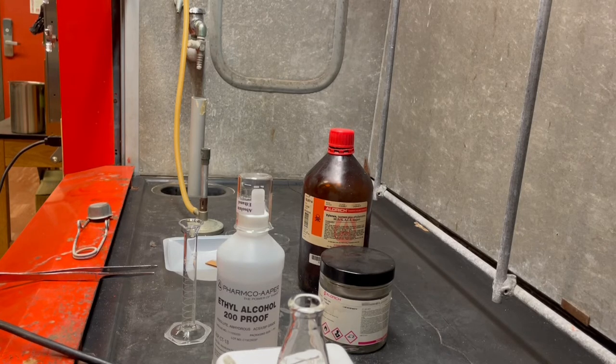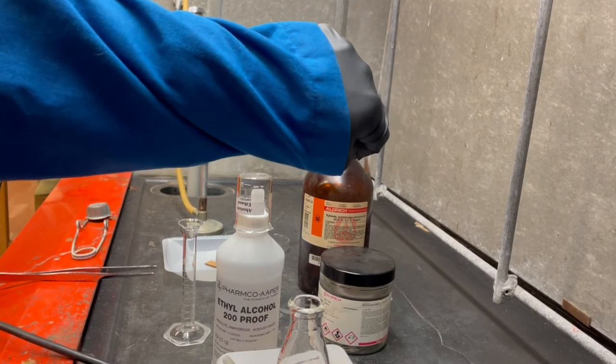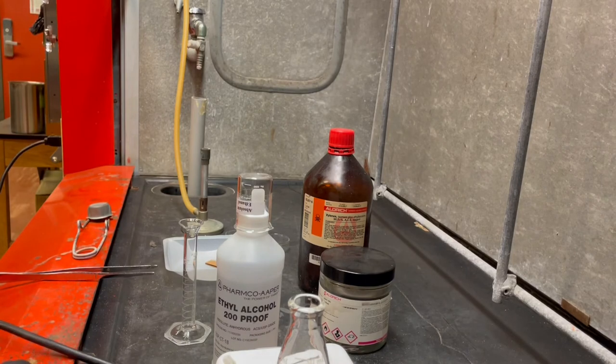And so we want to make sure that we're adding it slowly, at least at a controlled rate that is safe. And of course, working in the hood, I have my blue lab coat on. As you saw when I was flame drying, I put my flame coat over the flame just to show you that it's a flame retardant coat. This is extra precaution that I'm taking when I'm working with extra pyrophoric things. Like I said, you guys don't get to play with elemental sodium. So I'm going to go ahead and get that process started.